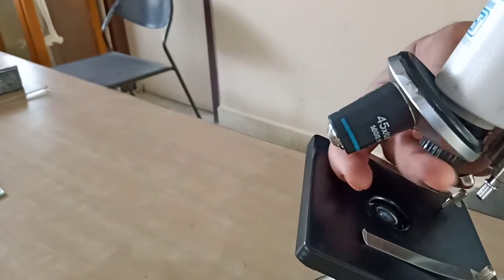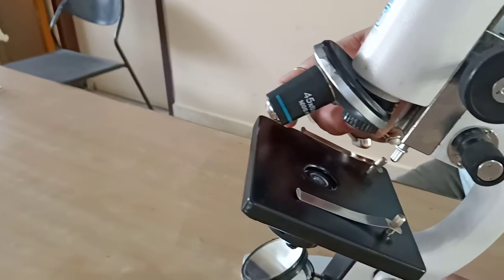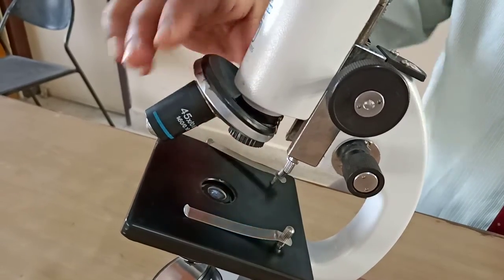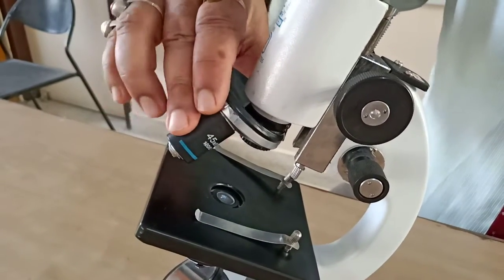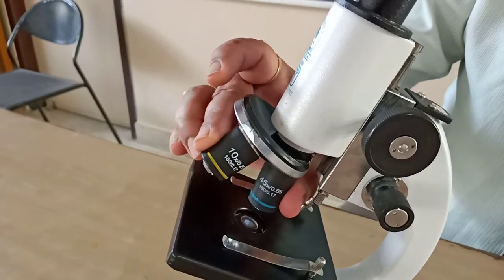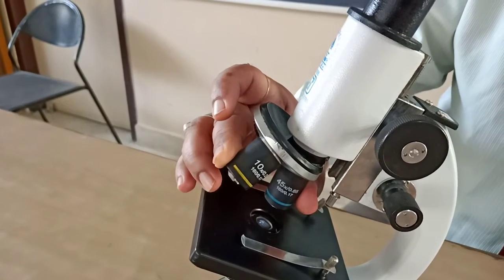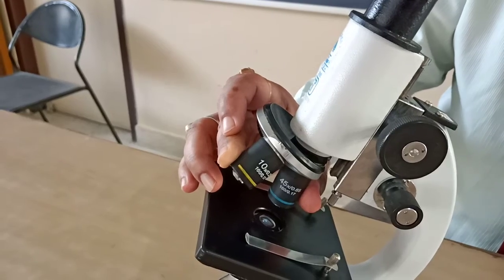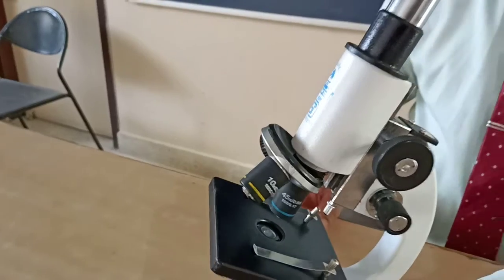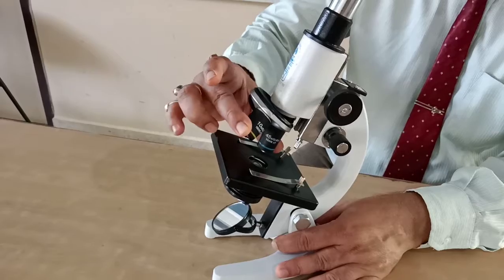Then one more point is there in the nose piece for setting a lens of higher magnification, maybe 60x or 100x, this point. So this is movable. We can move it and we can set the objective lens as per the requirement. How much magnification we wish to have, 10x or 45x or 60x or 100x or 200x. So next one, this is the nose piece. This nose piece is movable.